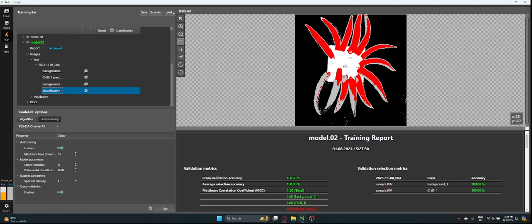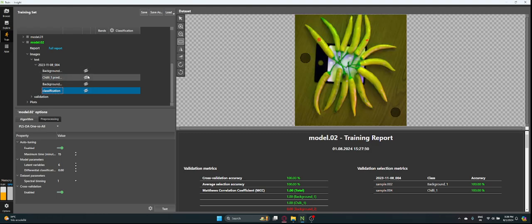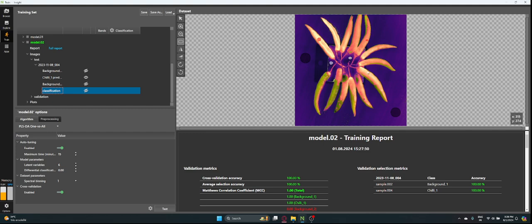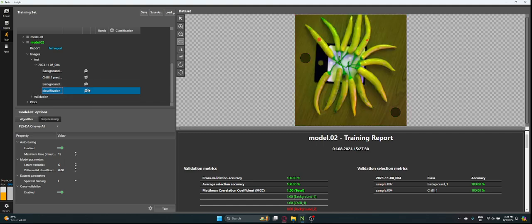Well, as I said, it's not a good idea sometimes. You can see that it's not selecting. Now all the stem is gone. And the chili, let me go with the background. This is what the background selected. So in the chili, this area is the chili selected. The heat map is where all the white should be.